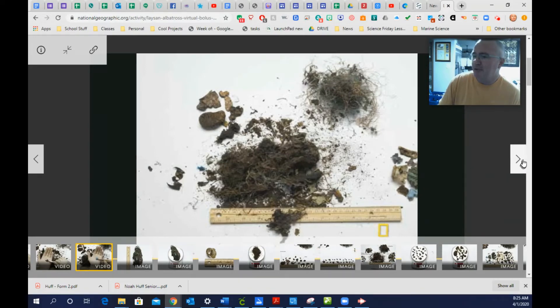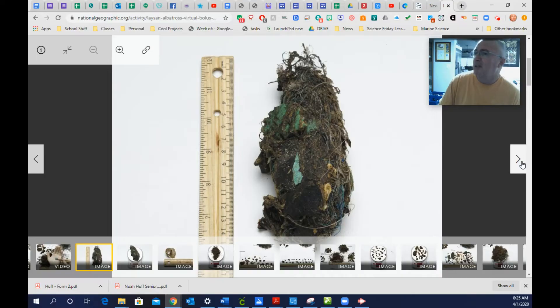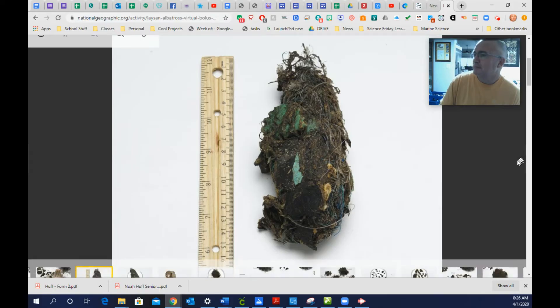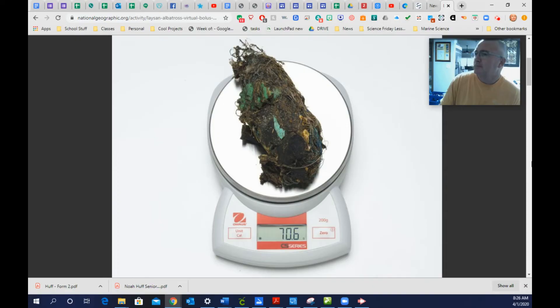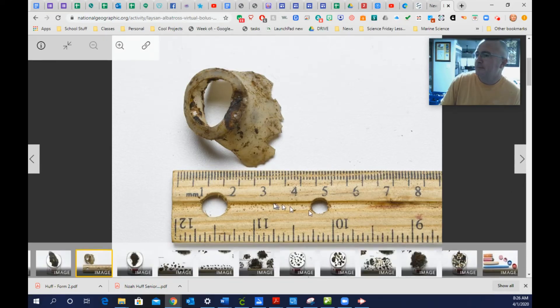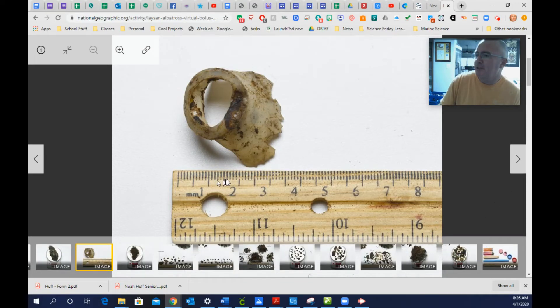This right here might even be a piece of pumice — volcanic rock that actually floats on the water. Now I'm going to show you some images; I'll stop about 10 seconds on each one. The information in these slides you'll need to use as data for your lab write-up. Remember this is metric — centimeters — we're using this side of the ruler.